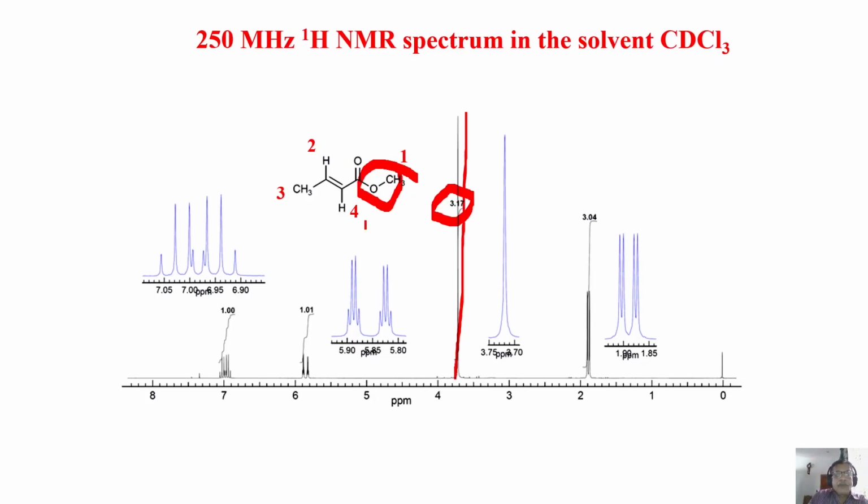Next, we have to see this CH3, this H, and this H. How are we going to assign the CH3 group? In normal examples which we took earlier, what was the pattern you used to see? We always took CH3 coupled to CH2. CH3 used to be a triplet, or a singlet, or when it is coupled to CH, it was a doublet.